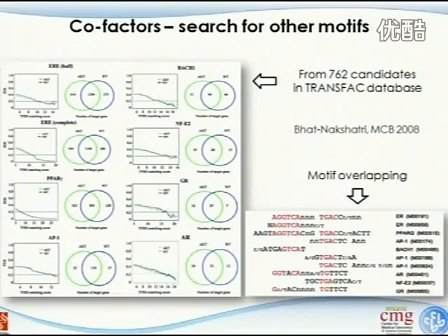So very simple strategy. Everything just based on what I talk about today. Nothing fancy, right? Based on the position weight matrix, you got enriched regions, got those sequences, calculate the matching score, adjust your threshold, and see whether your enriched region will beat the random selected region. That's all. Very simple strategy. But this can help us to get there.